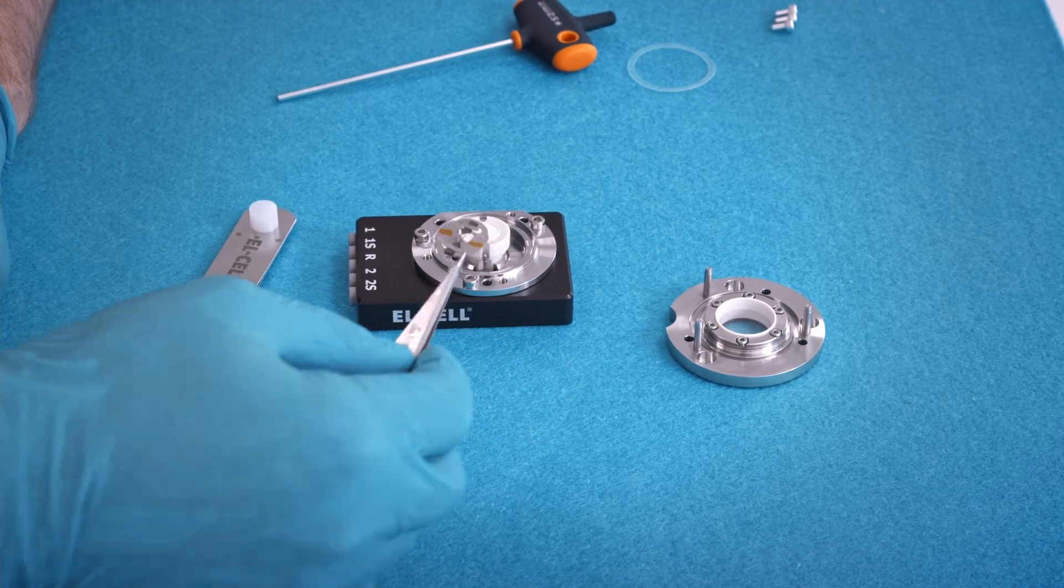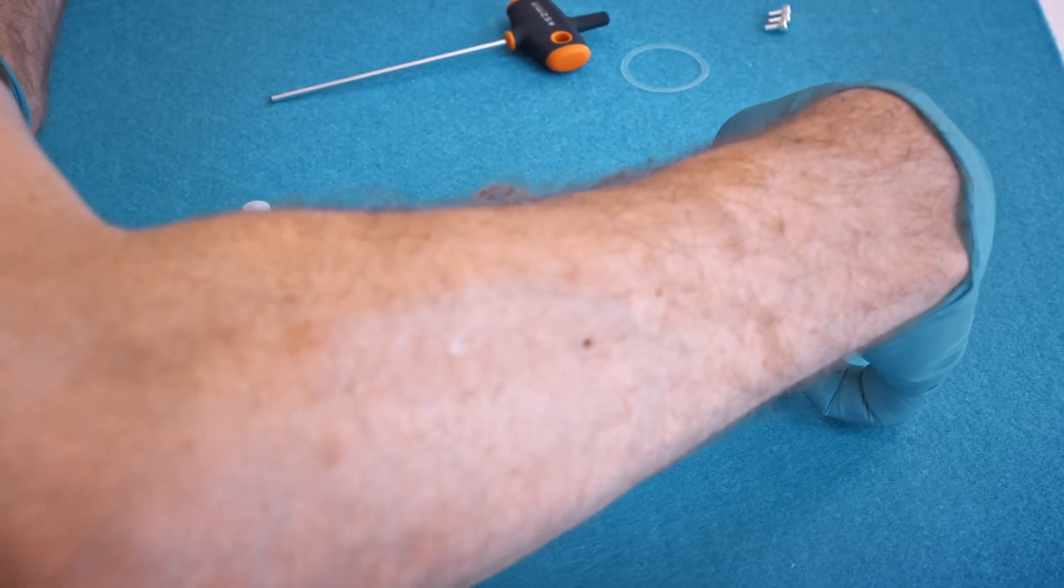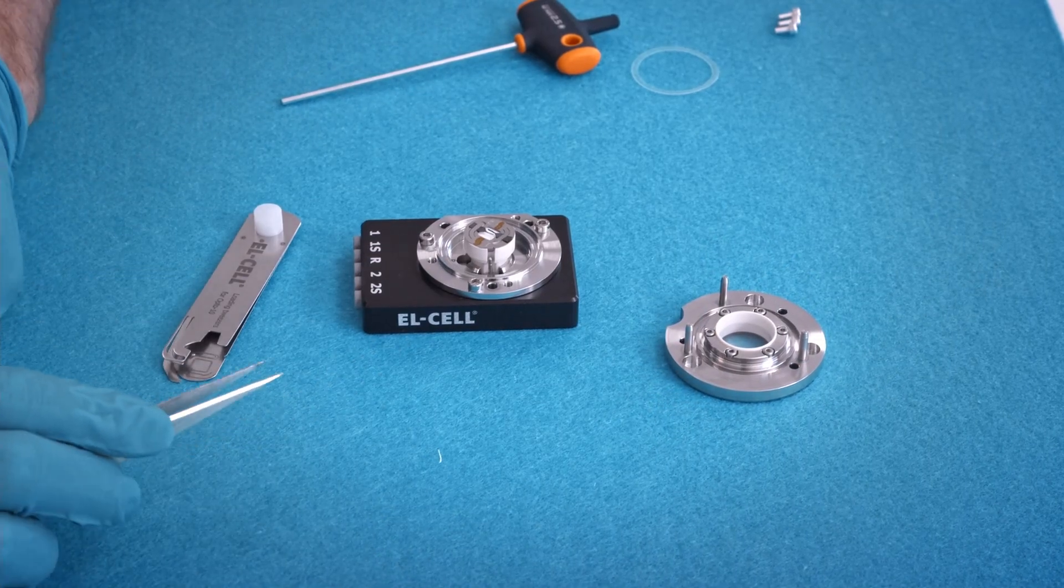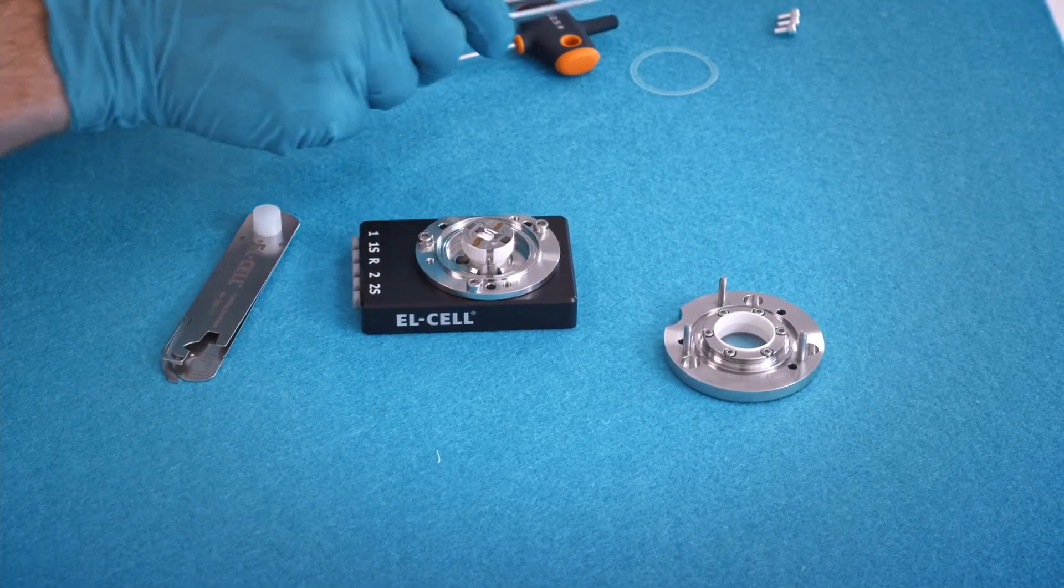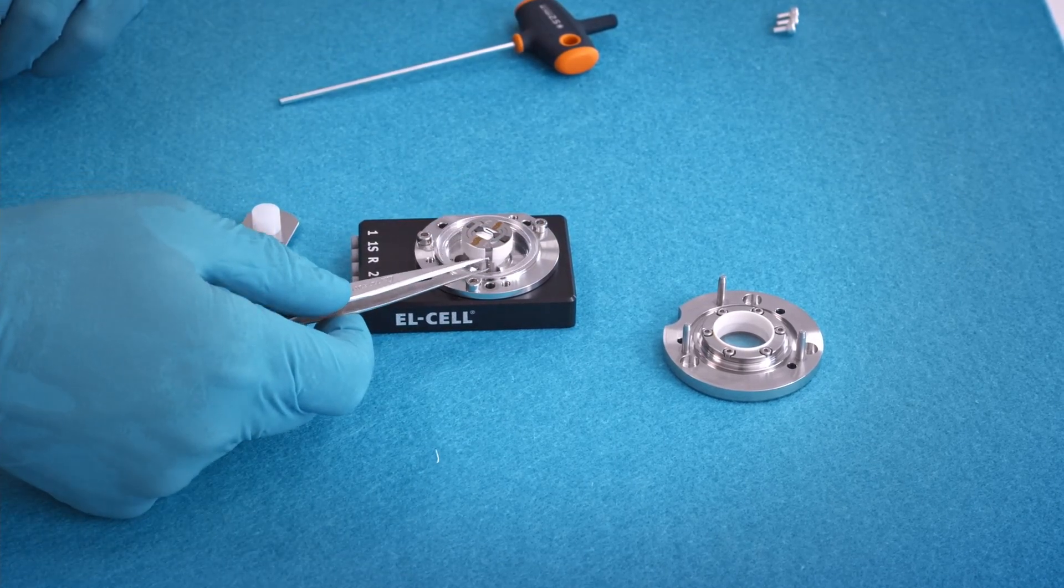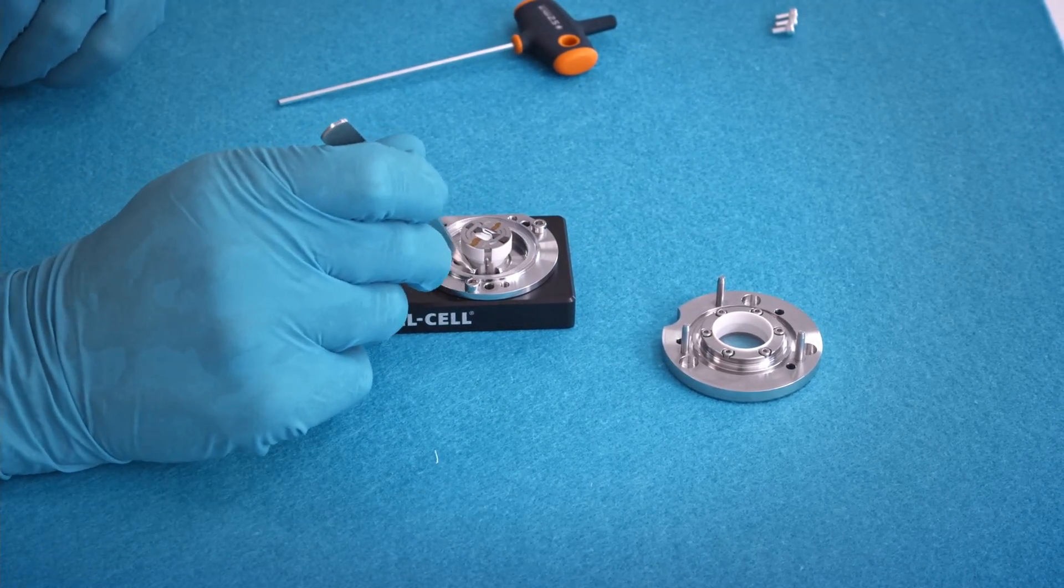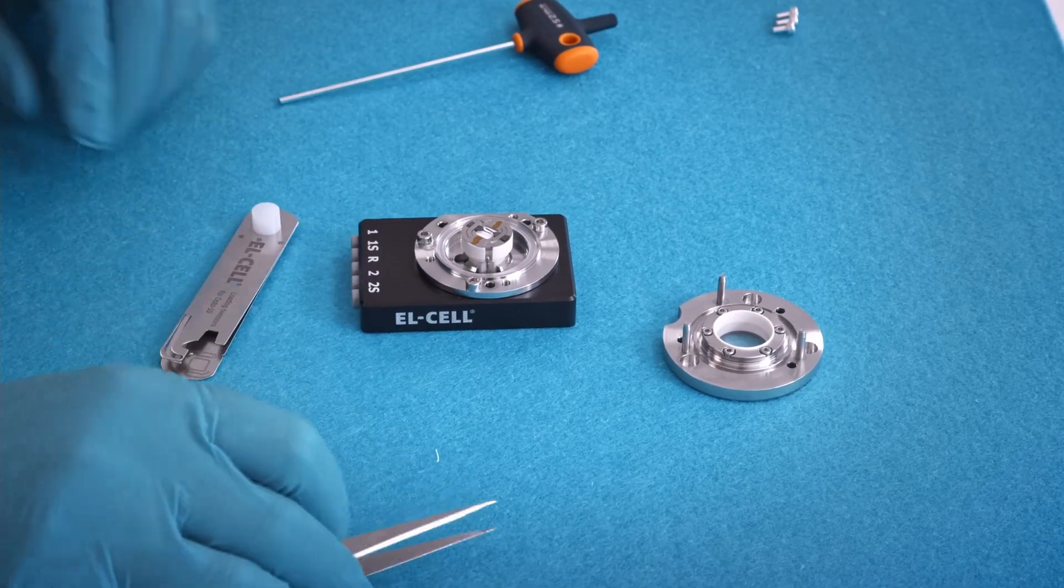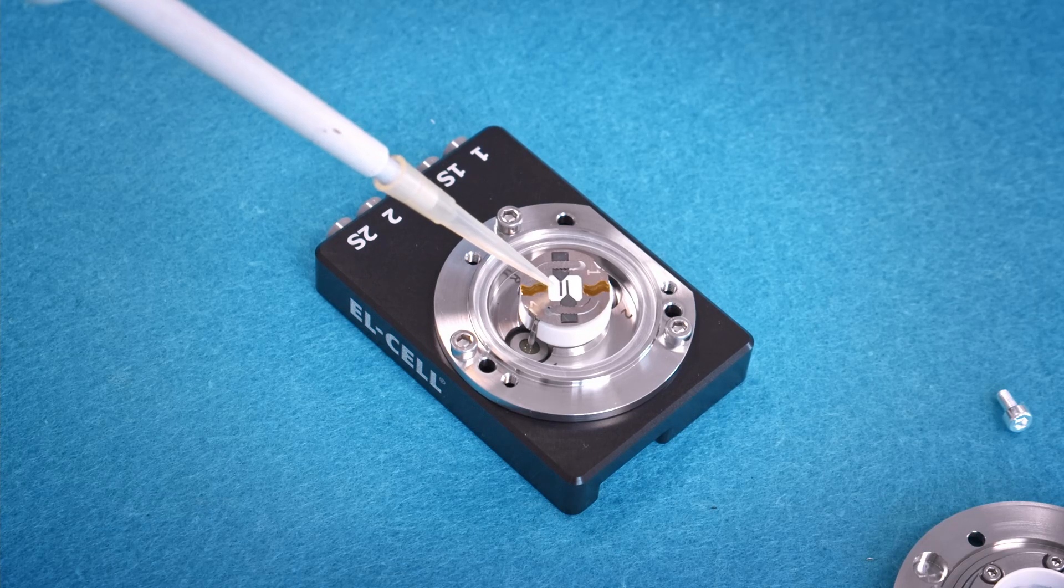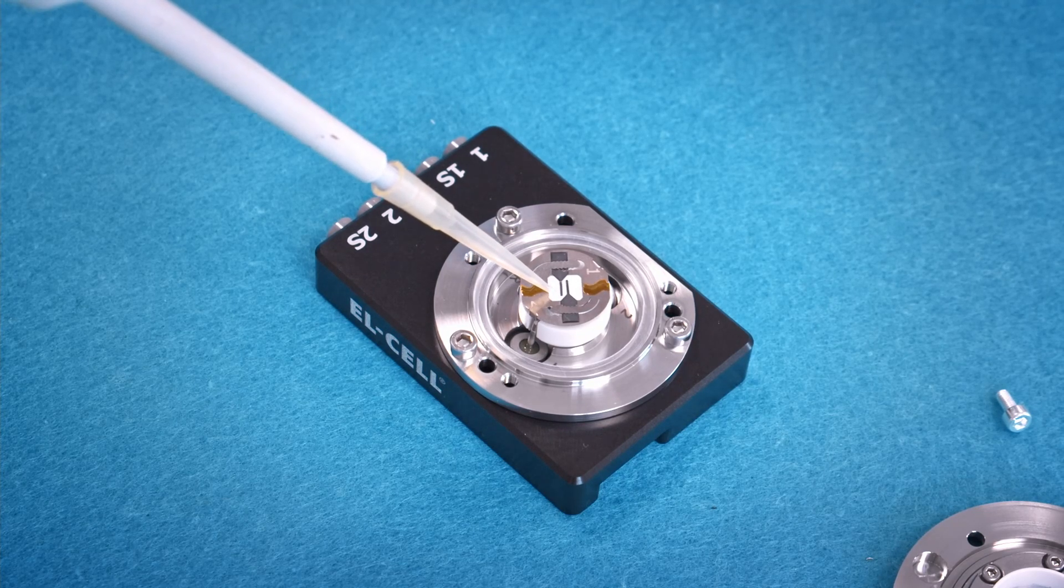Then we insert the sample holder with the electrode strips attached. Put the seal in place. Add some electrolyte onto the separator and the electrode strips.